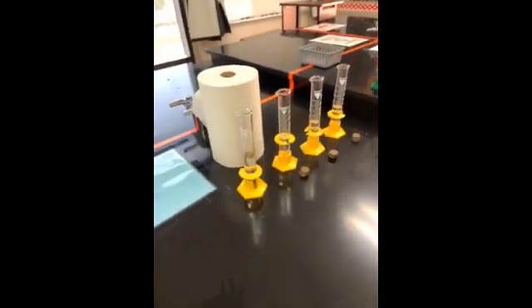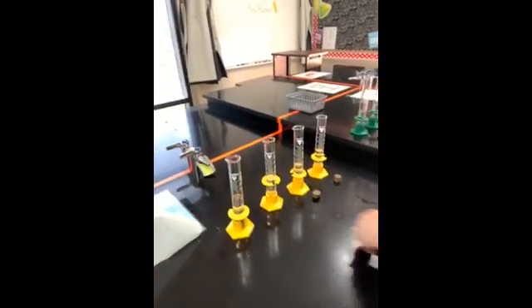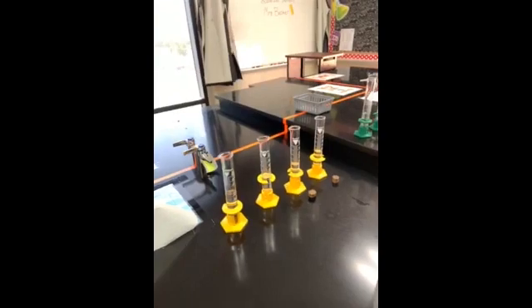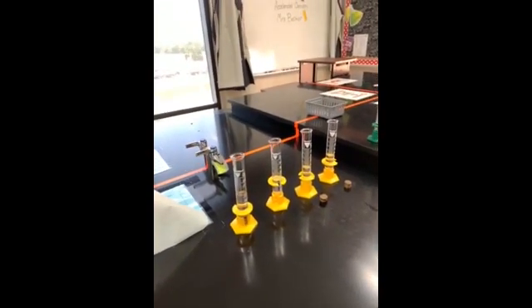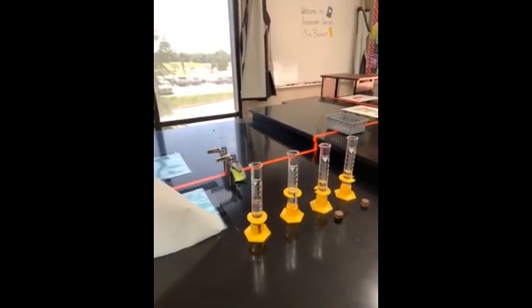Now we have the volume of the water and the pennies. To get the pennies, you subtract. Water plus pennies minus water equals pennies. All right, trial 2, water only. This one's a little bit lower. This one looks like 25.225.